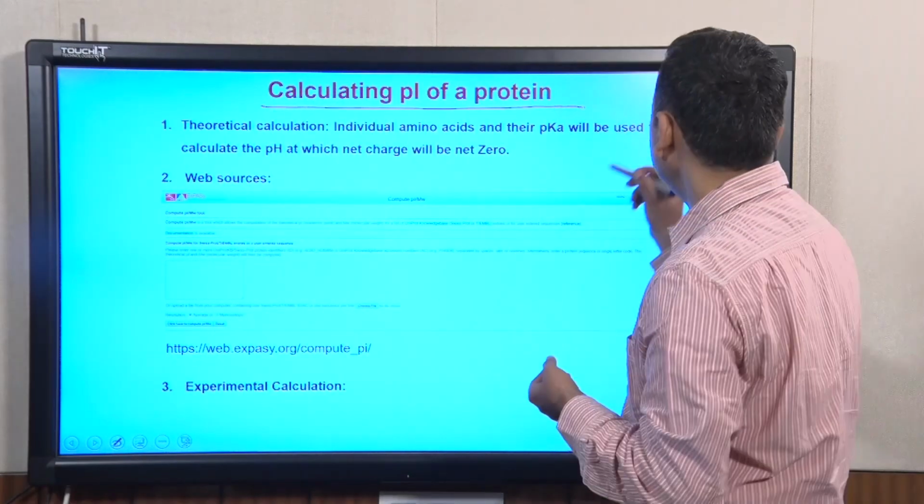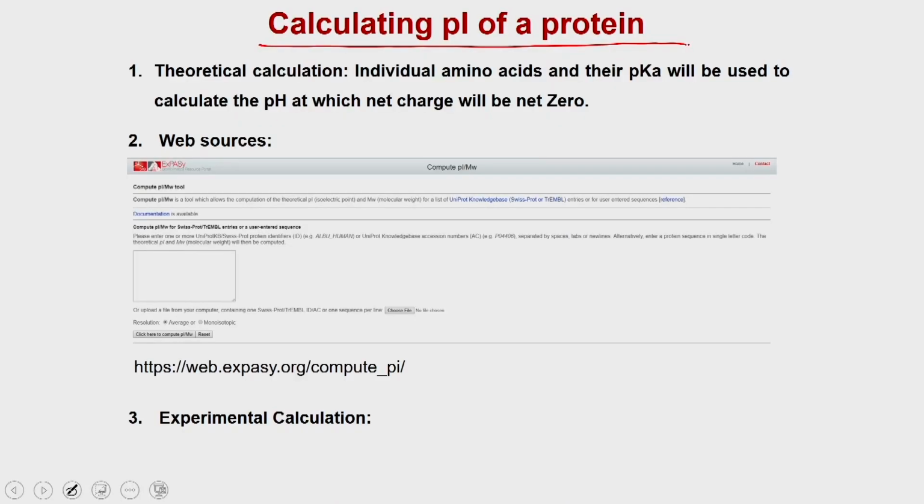Suppose they use cation exchange chromatography. Once you do it and load your lysate, you are going to get 2 fractions: the bead bound fraction and the flow through.